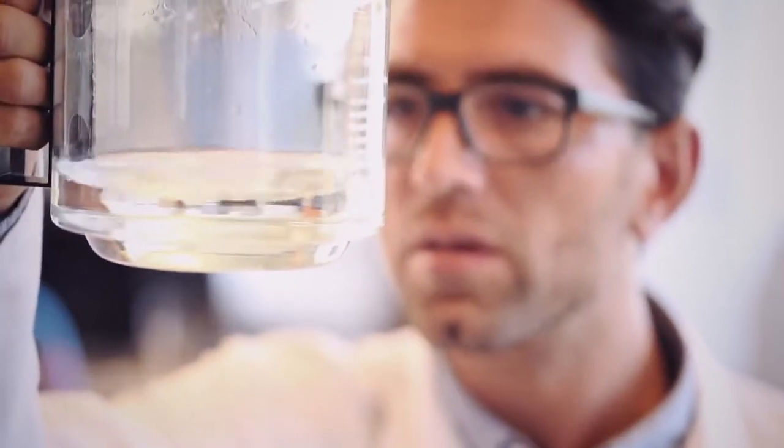Picture, if you will, an XRD benchtop that doesn't require expert knowledge, while allowing you to significantly reduce your investment.